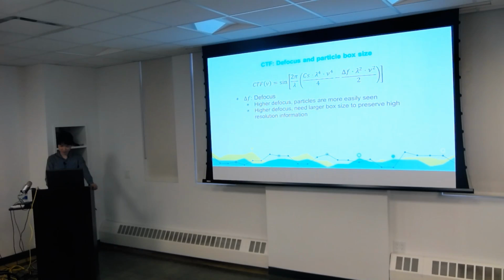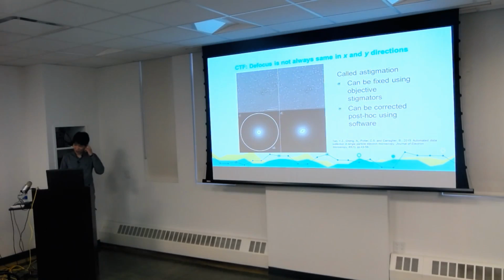Okay, so this is the second concept I'll touch on with defocus. Any questions so far? Okay, the third concept is that defocus has a bit of anisotropy in that it's not always circular.